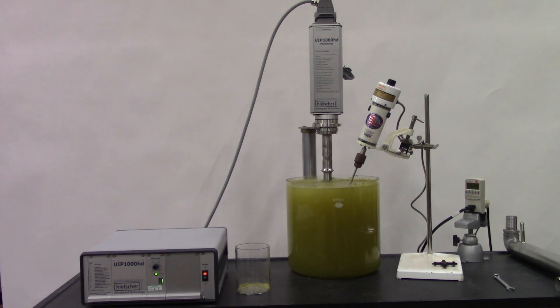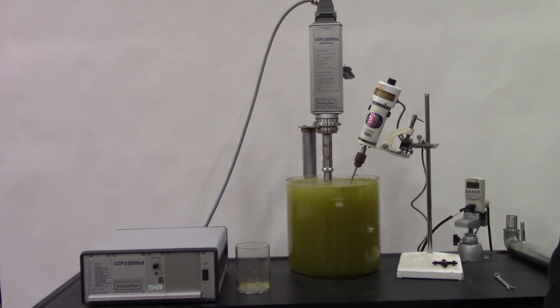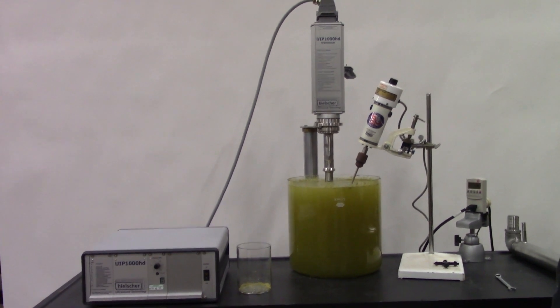Typically, what is done is an analysis for either GC-MS or LC-MS to determine what you've extracted from this process. We certainly can supply those analytical instruments.